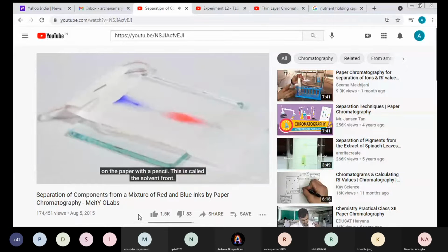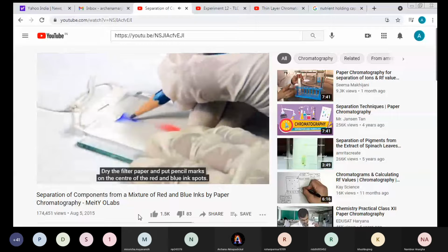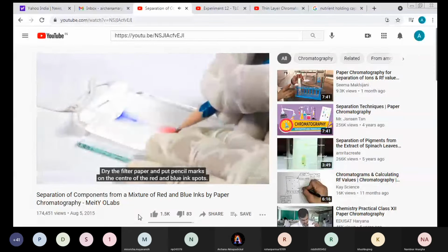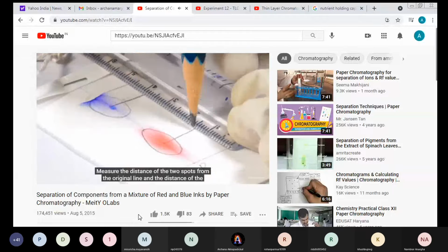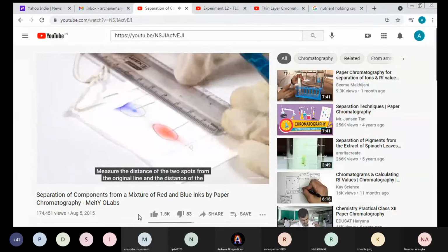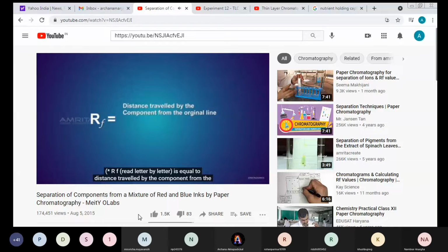This is called the solvent front. Dry the filter paper and put pencil marks on the center of the red and blue ink spots. Measure the distance of the two spots from the original line and the distance of the solvent from the original line. Calculate the RF values of red and blue inks by using the formula: RF is equal to the distance traveled by the component from the original line divided by the distance traveled by the solvent from the original line.